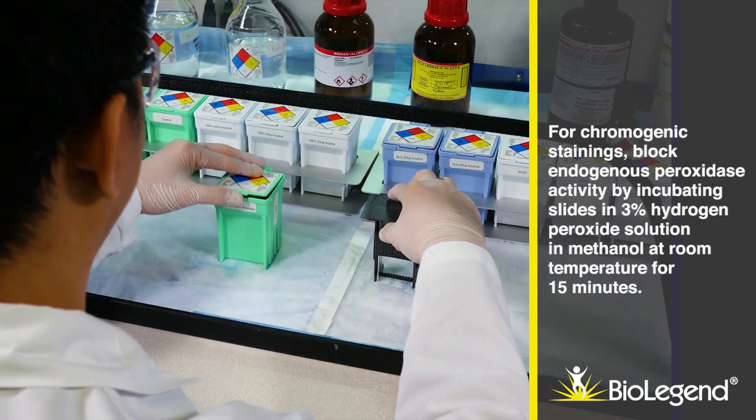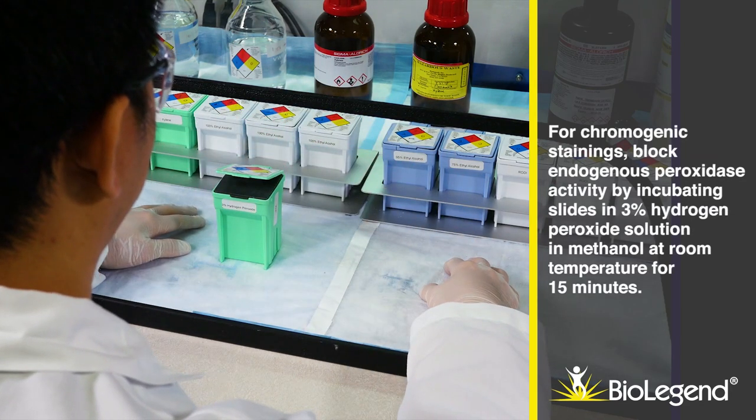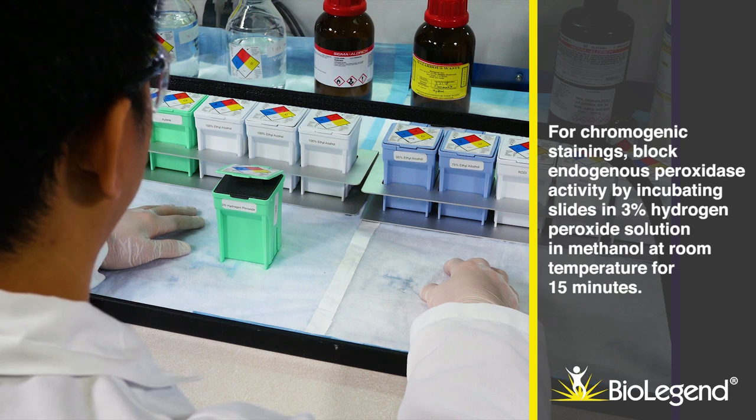For chromogenic stainings, block endogenous peroxidase activity by incubating slides in 3% hydrogen peroxide solution in methanol at room temperature for 15 minutes.